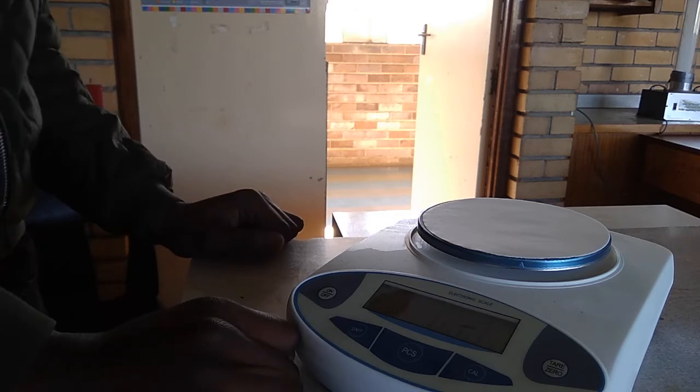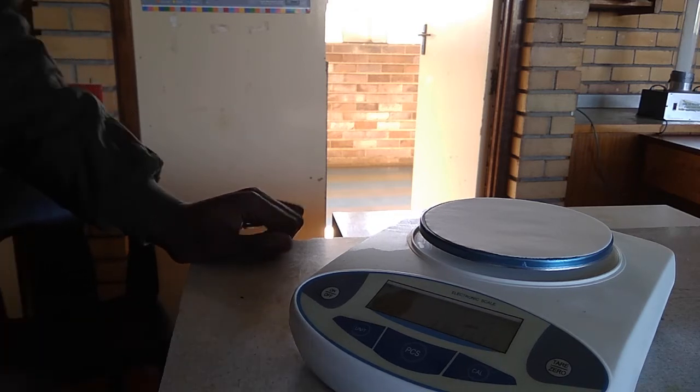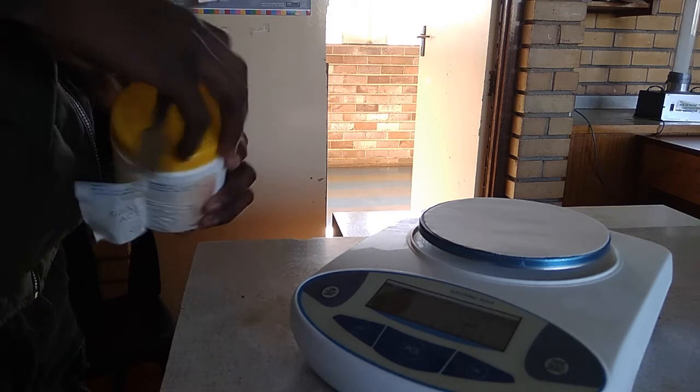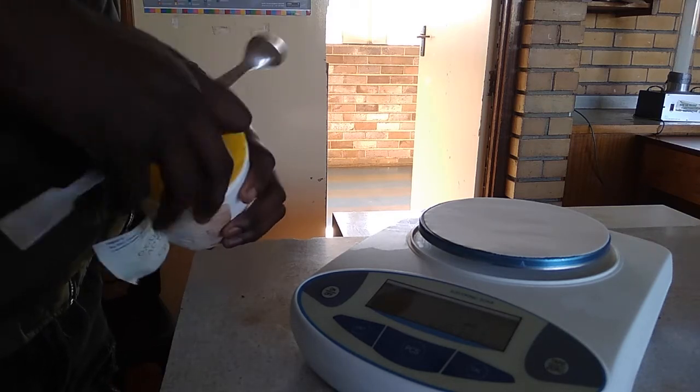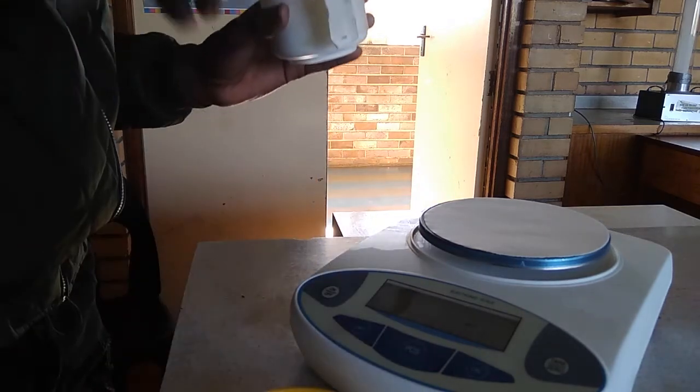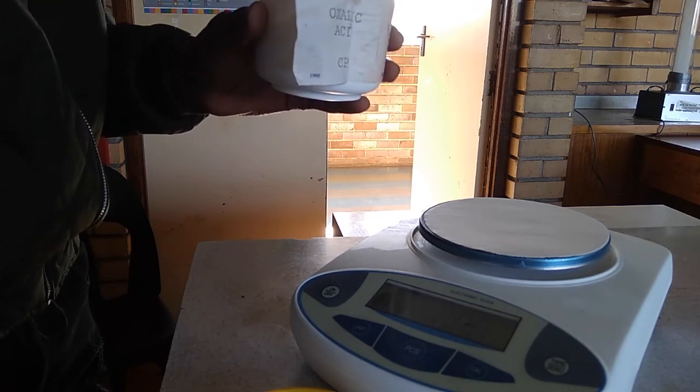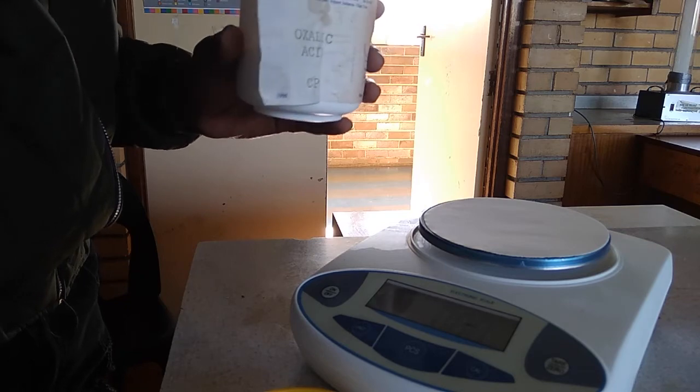Okay, so Pascal, can you grab, just check if that says oxalic acid, and just take a spatula, give it a wipe with some toilet paper to make sure that it's clean. Okay, then what you're going to do is you're going to dump very carefully one spatula full of oxalic acid in the center of that paper without losing a single crumb. I would say just a little less. That's great.